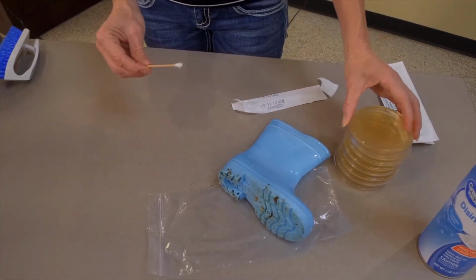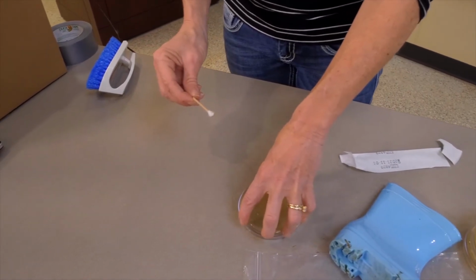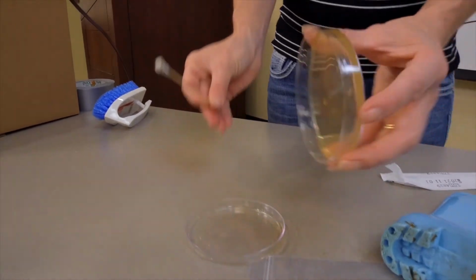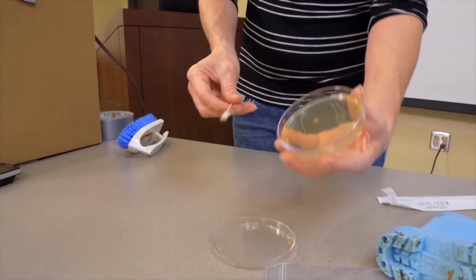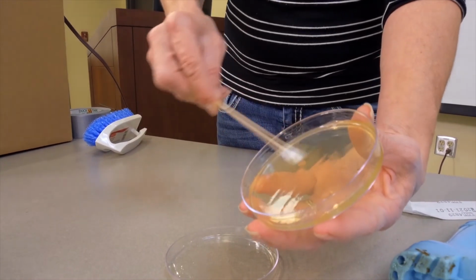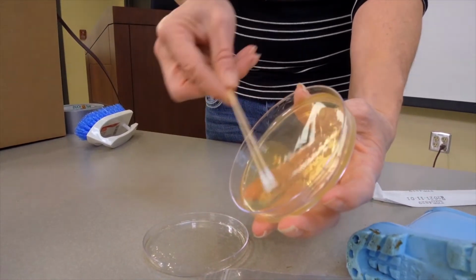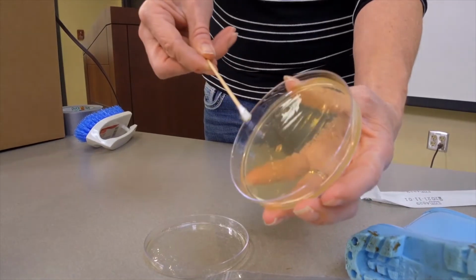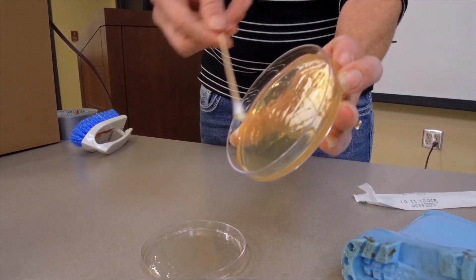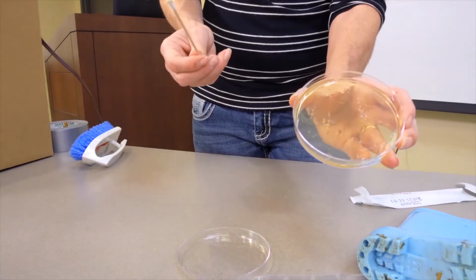Then we're going to take our pre-prepared agar plate, and we want to grab it by essentially the bottom of the plate. So the top is a little bit bigger, and the bottom is where our media actually is. So when I swab the plate, I'm going to streak my cotton swab back and forth. And then I'm going to rotate my cotton swab essentially a 1/4 turn, and then rotate back again across my plate. Rotate my swab, rotate my plate. So I think of it as essentially swabbing all corners of my swab onto my agar plate.